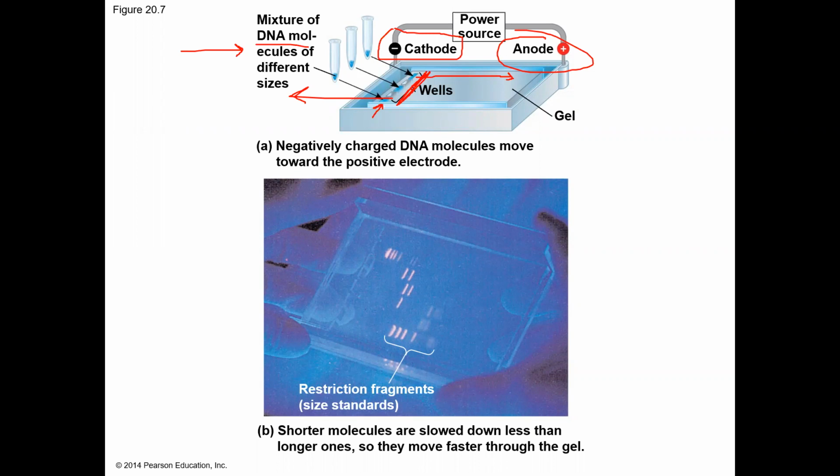So after you've separated your DNA in the gel electrophoresis chamber, you then can visualize it under a UV light source. And what you're looking at here is to see, well, I know what size my plasmid is. So you know what size that plasmid is right there. But let's say due to the DNA that you added to it, the plasmid is now a little bit bigger.